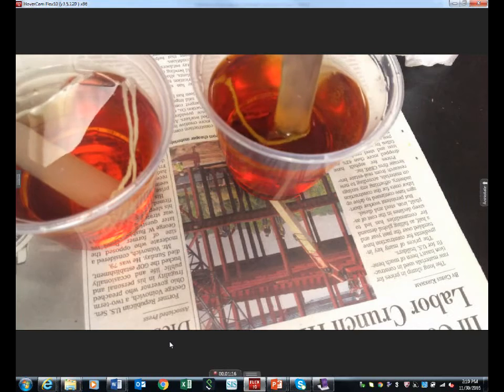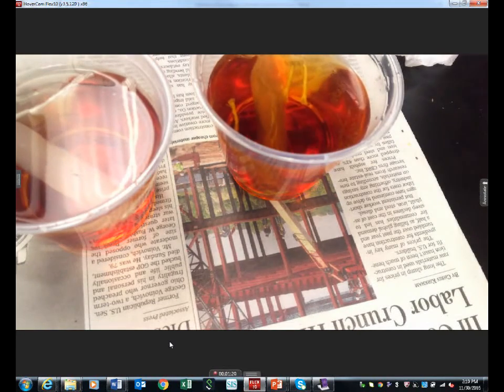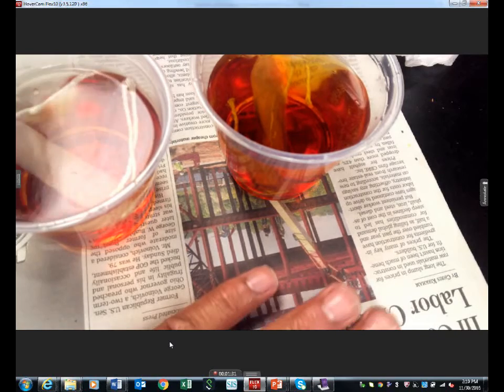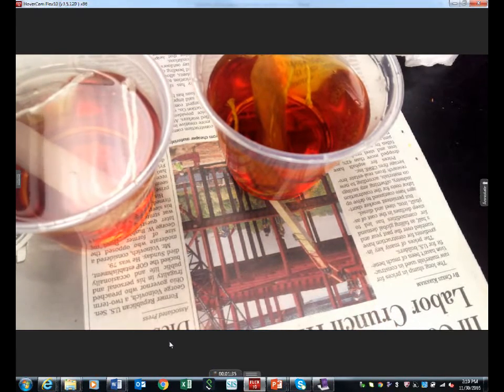At this point, starch has not left the bag. We can correctly say water is going in through osmosis. Iodine is being carried by the water — it's going in through diffusion. That's two of the four you've got to write about. So we're going to let this set for about 20 to 30 minutes, do some other things, and come back to revisit this.